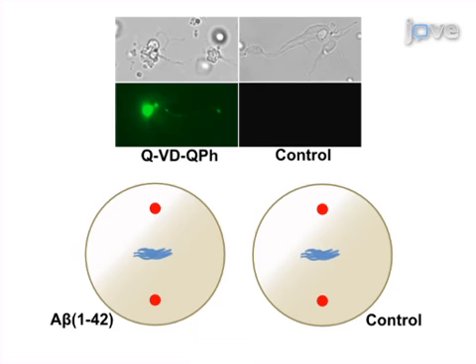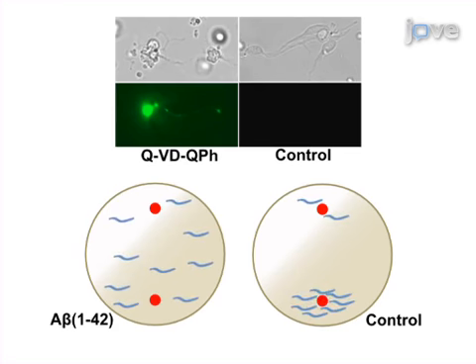Ultimately, results can show the effects of amyloid beta toxicity on ASE neurons' function and survival through behavioral and pharmacological assays. This method can help answer key questions about neurodegeneration, such as elucidating specific cellular and molecular mechanisms underlying the neurotoxic effects of amyloid beta oligomers.